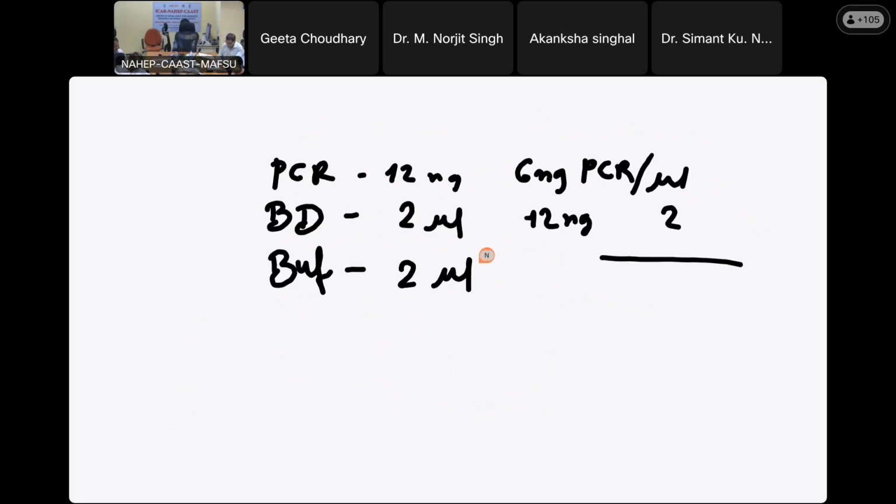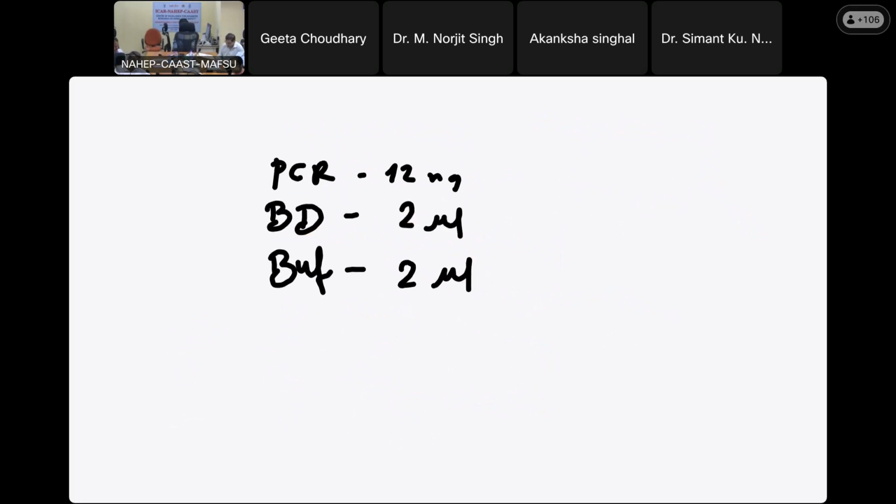Okay, let's talk about primer. The primer you usually use is 10 picomole, right? It comes as 100 micromolar. You make the stock solution of 100 micromolar. The company tells you how many microliters of water you have to add, and you add and dilute that 10 times, and that is your working solution.